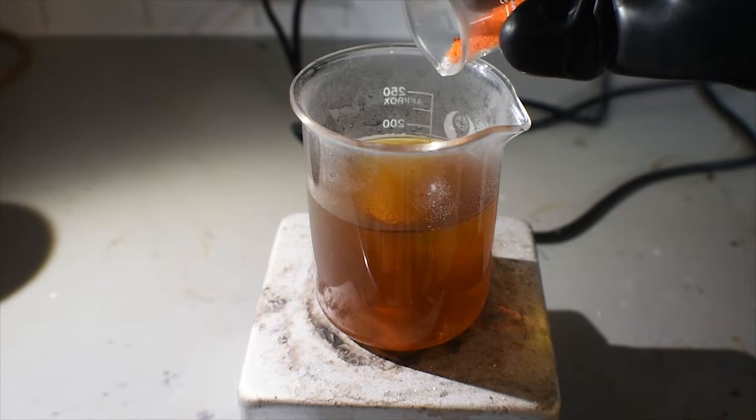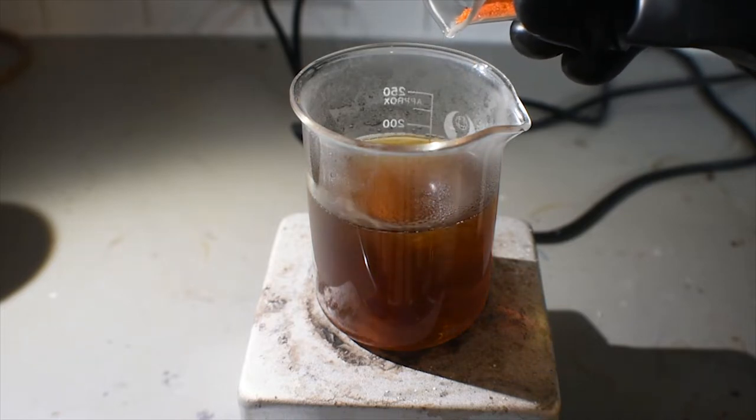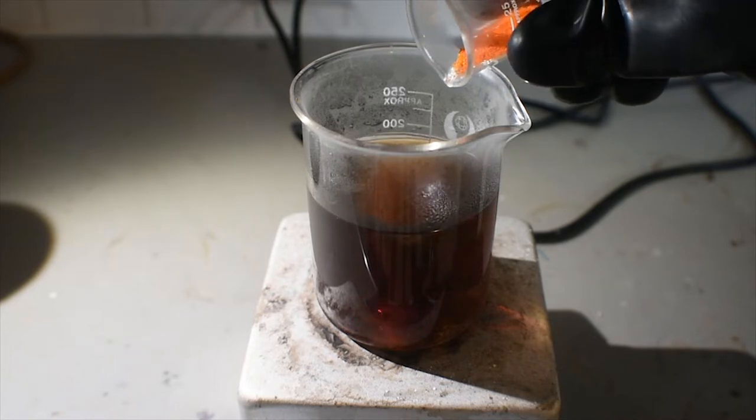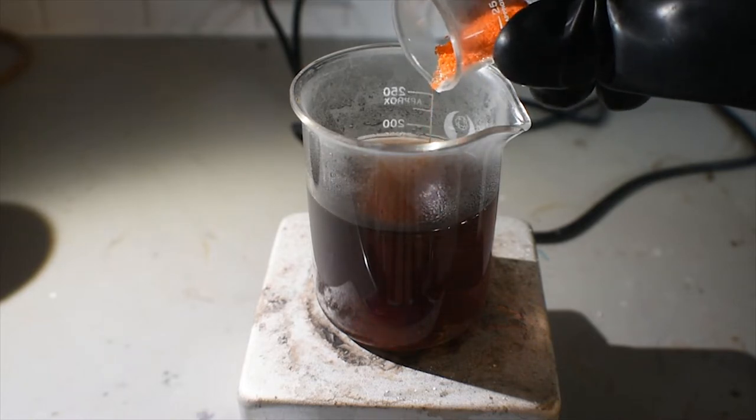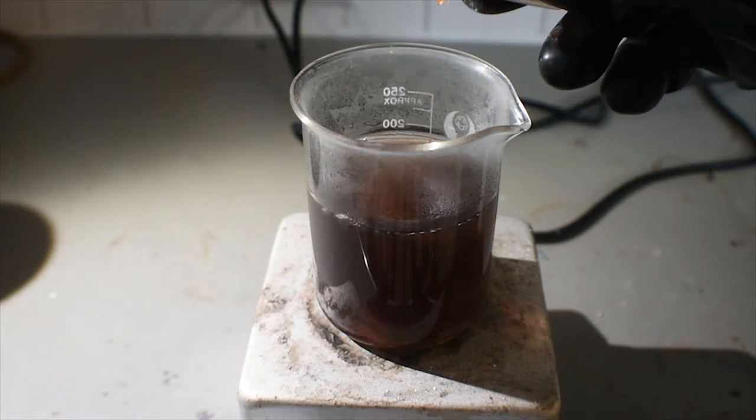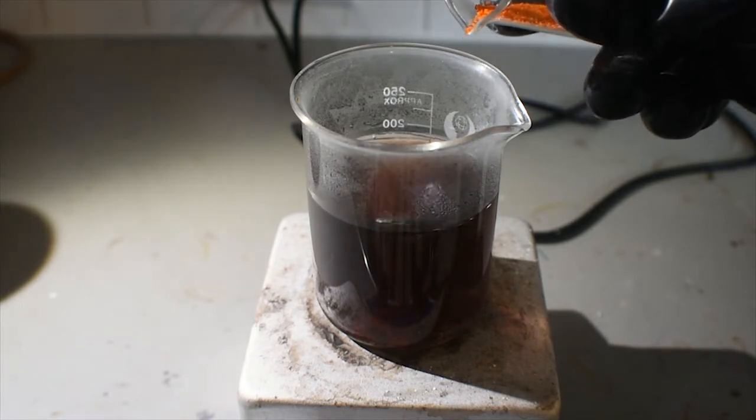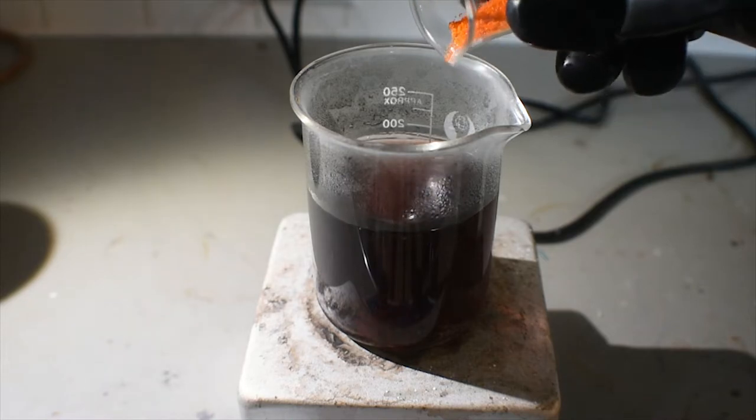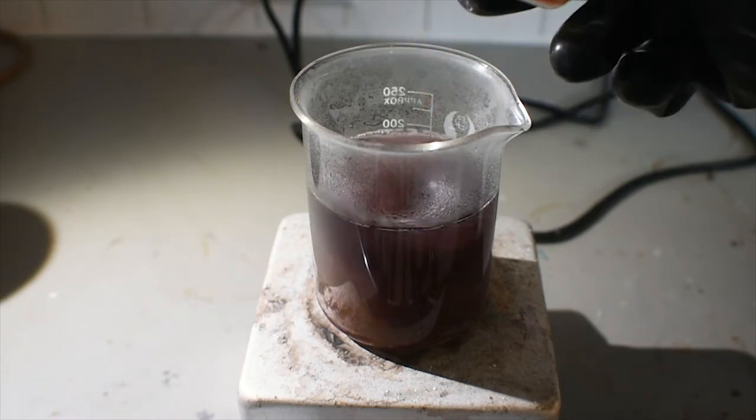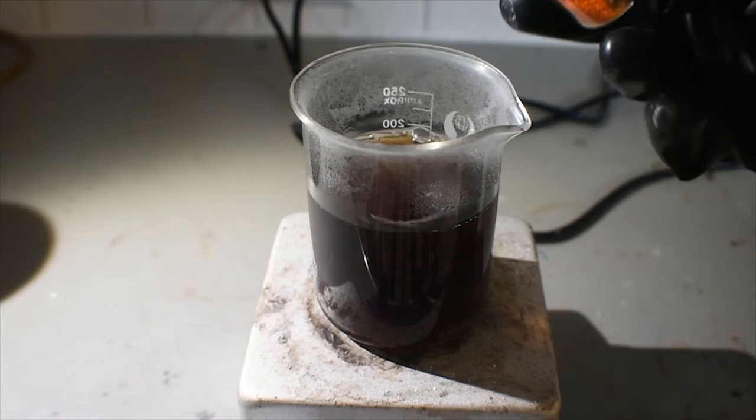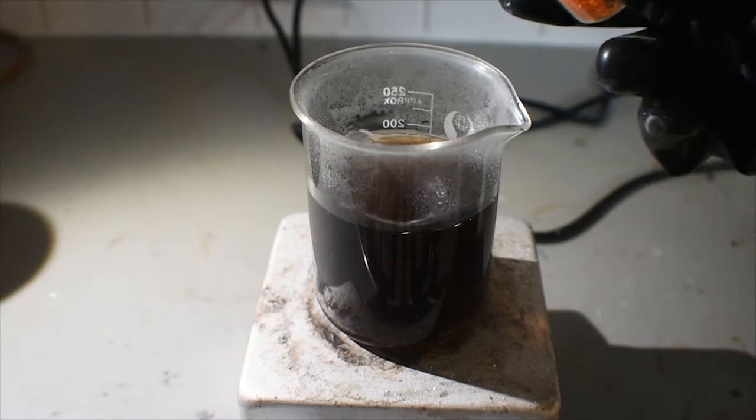As you can see, the color is changing, and there is evolution of CO2. As the dichromate is oxidizing the oxalic acid and oxalate, while simultaneously forming the potassium trisoxalate chromate. Do this slowly, as you obviously don't want to have it bubble out of the beaker.